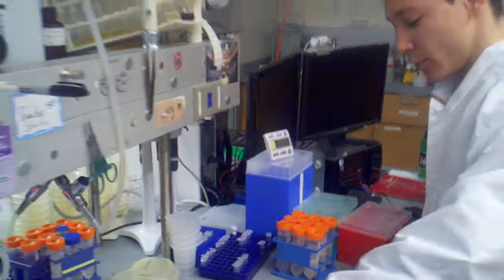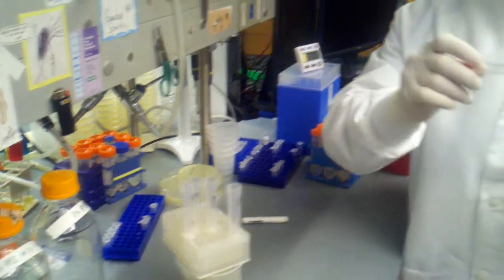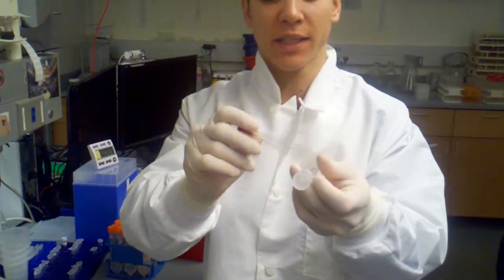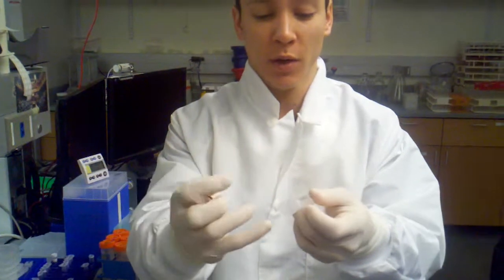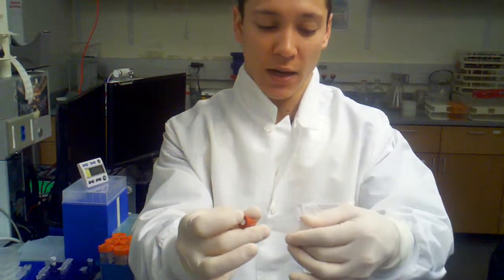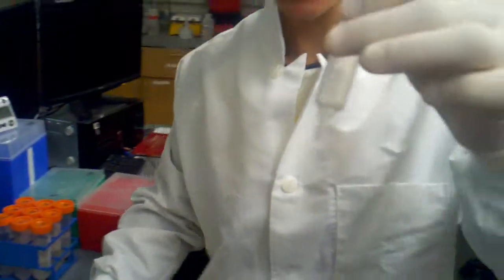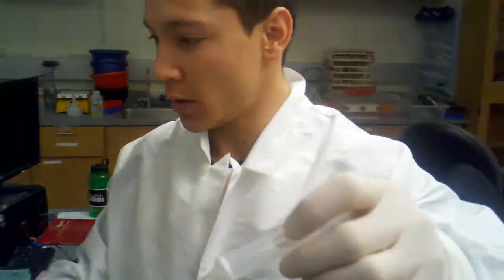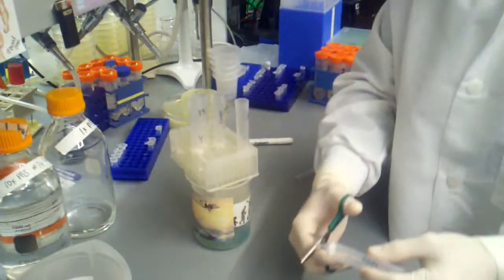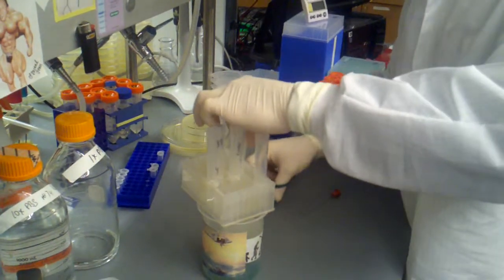In order to do that, we have these little flow-through columns. I've already labeled them, and these ones are all ready to go. Usually there's this little white thing in here, but it doesn't start off with that. We just have an empty tube, and we put one in there, and then I take this little ramrod and push it down. That is what stops our resin from going all the way through. Then we just want to chop off the top of these. Hopefully these scissors work. Looks like they do. And we're just going to pop them in.